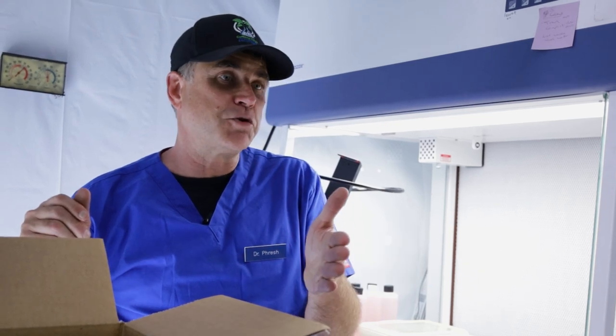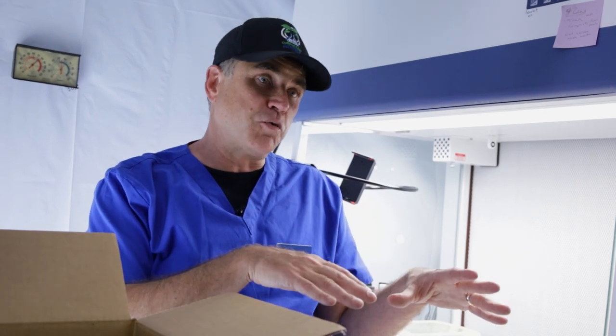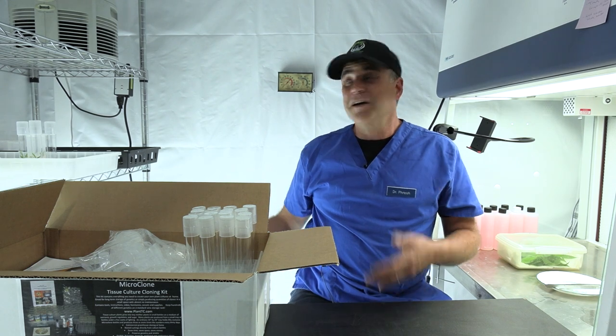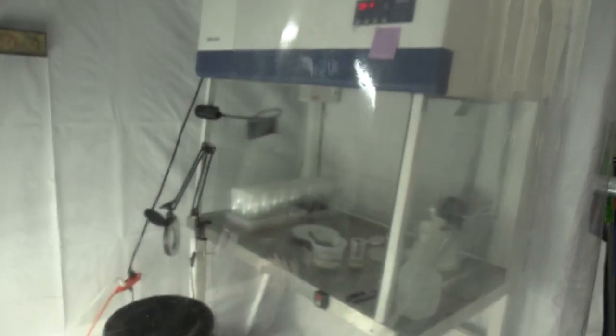No plants get over six weeks old — maybe eight if you need an extra clone cut — but everything will go on to flowering. When it leaves, everything that remains inside that space is going through culture, which is its own clean selection step, and is being sprayed and managed while it's on the shelf. Propagation is a vending machine for clean plants. Let me introduce you to the kit and my favorite space in the building — my warehouse tissue culture lab.